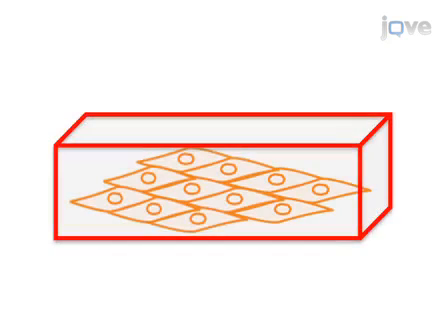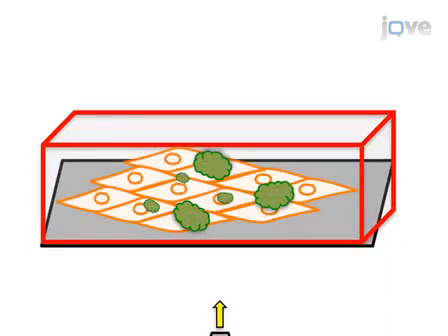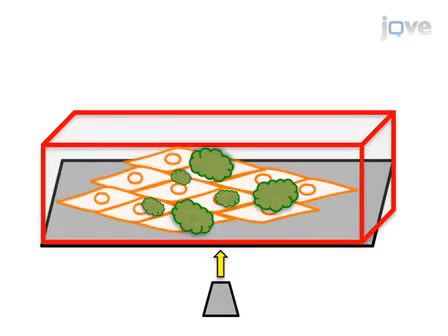The next step is to place the bacteria and airway cells in contact with each other in either a static setting or in a flow chamber. The final step of the procedure is to let bacterial biofilms develop over time while assessing the viability of the airway cells. Results can be obtained that show biofilm formation on live airway cells through fluorescence microscopy.